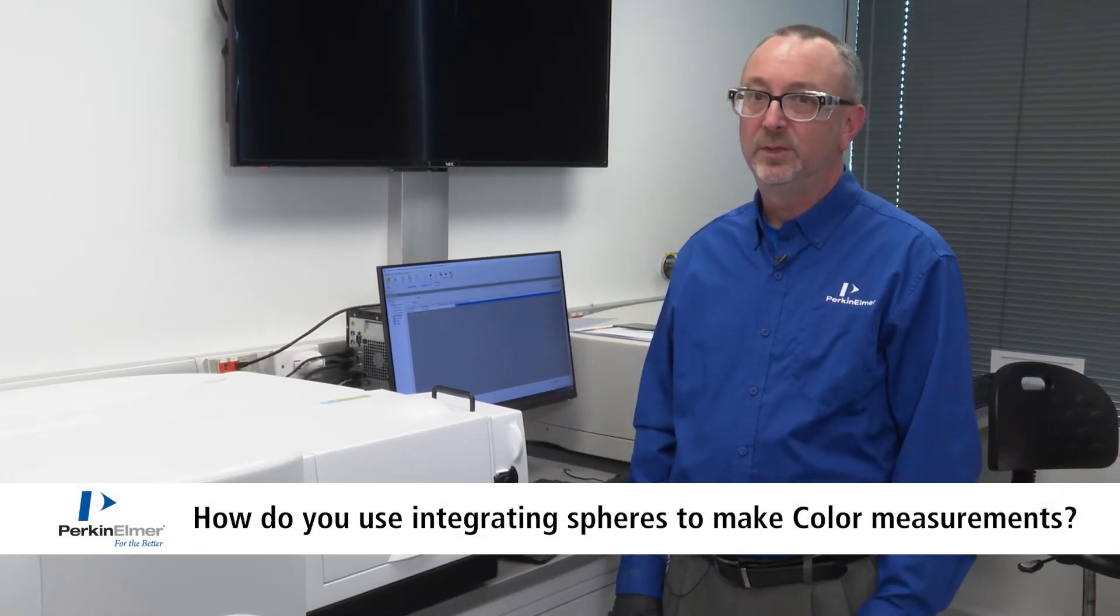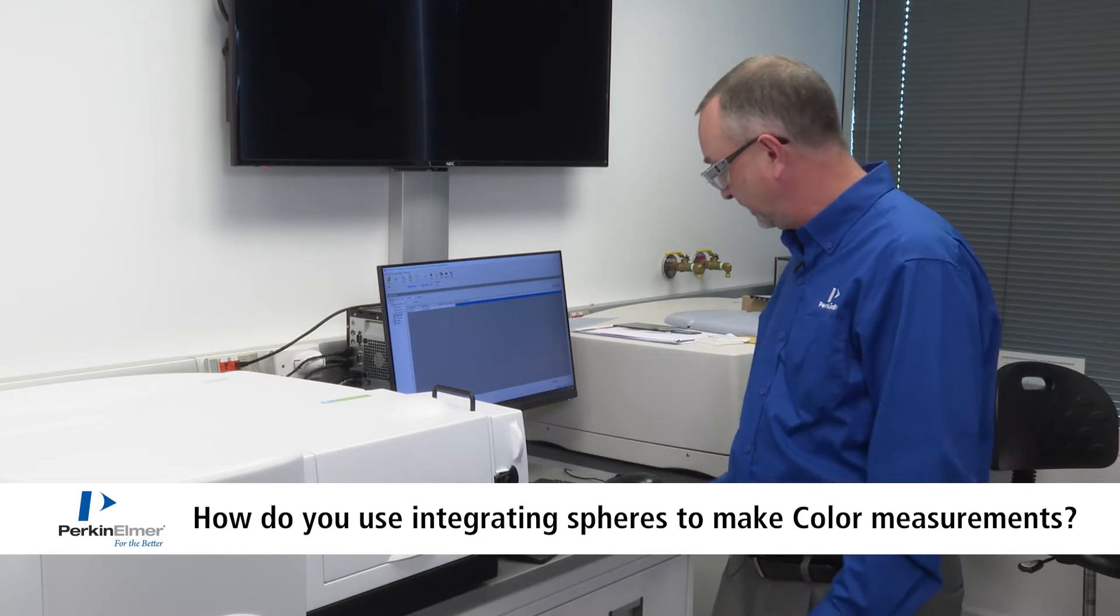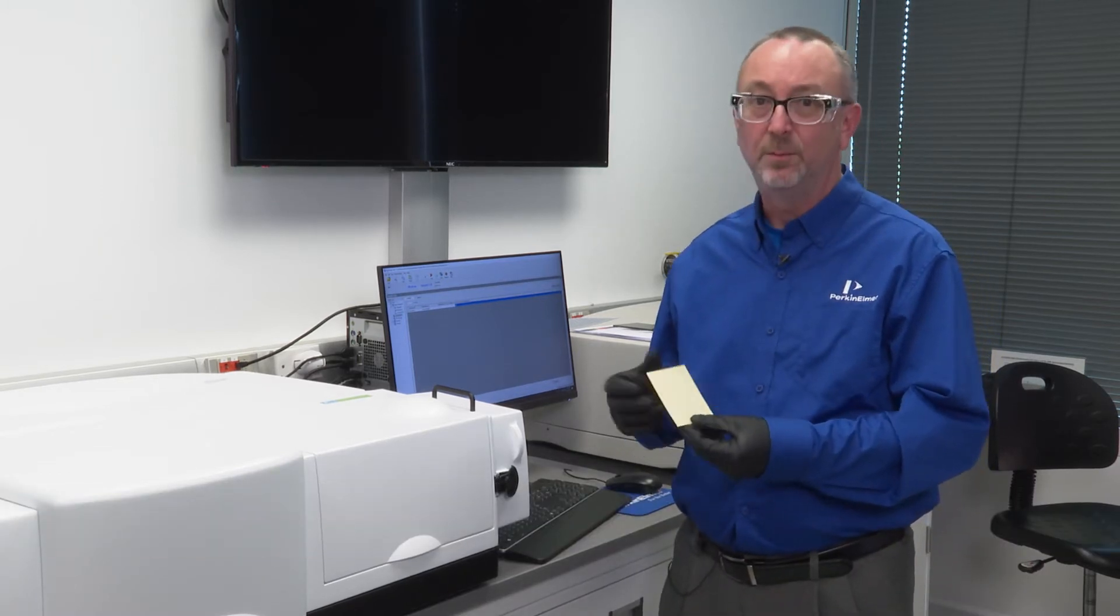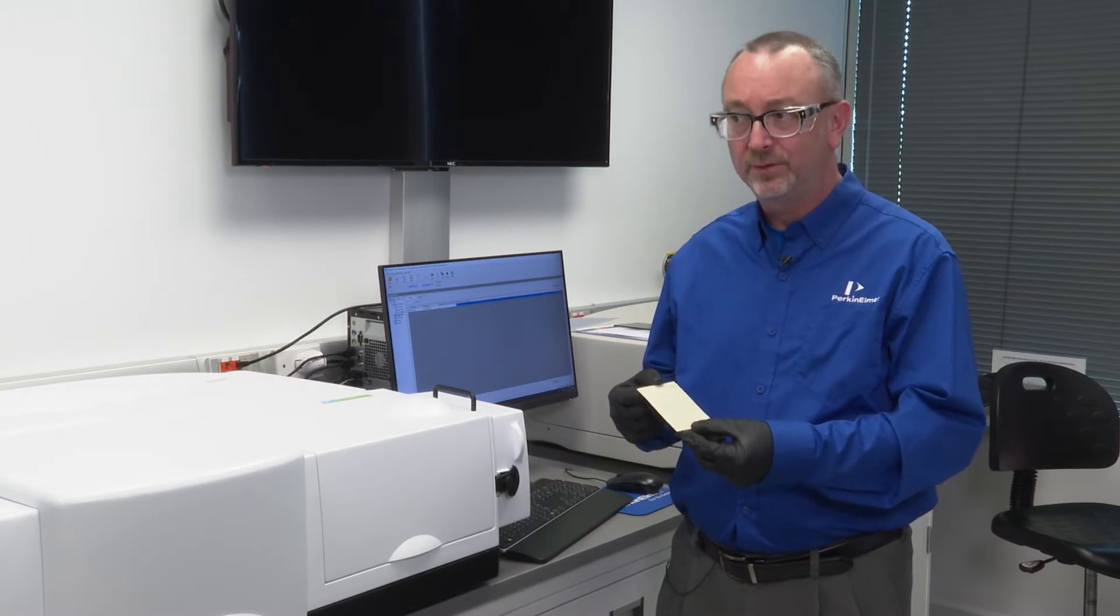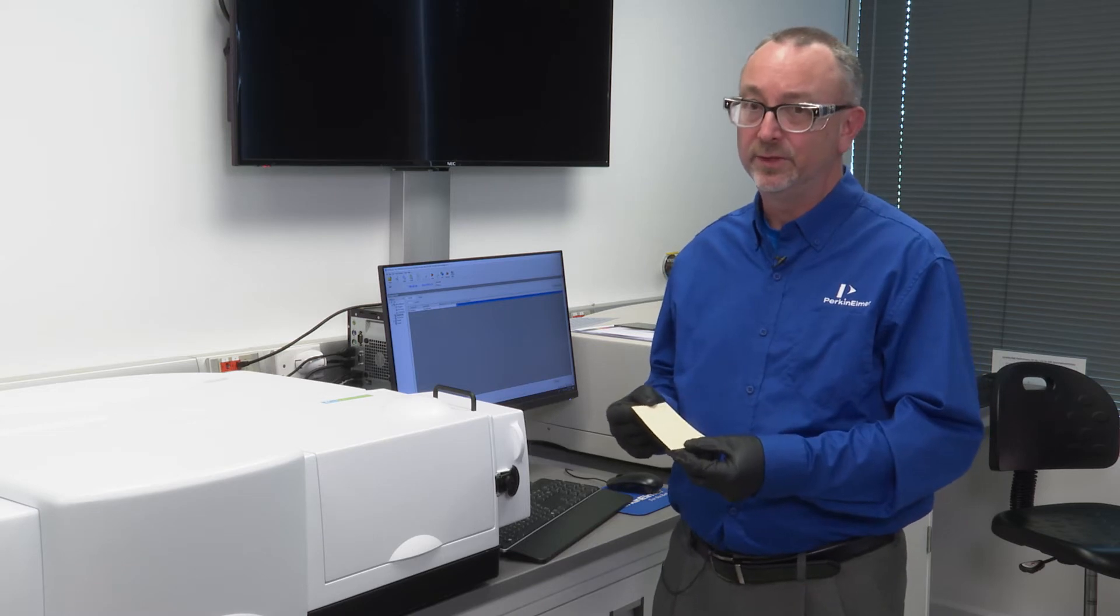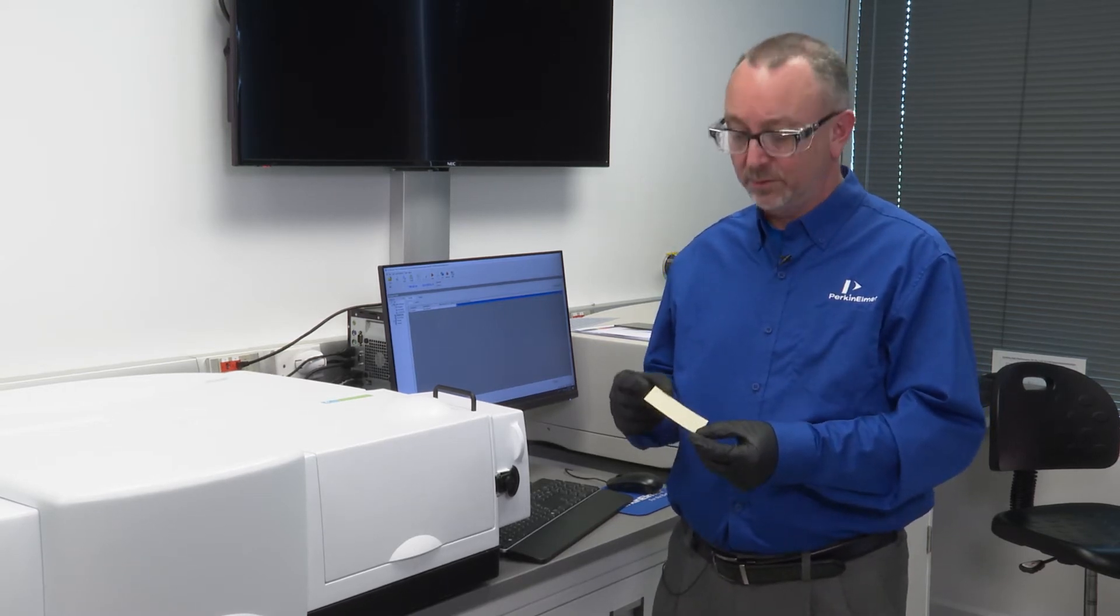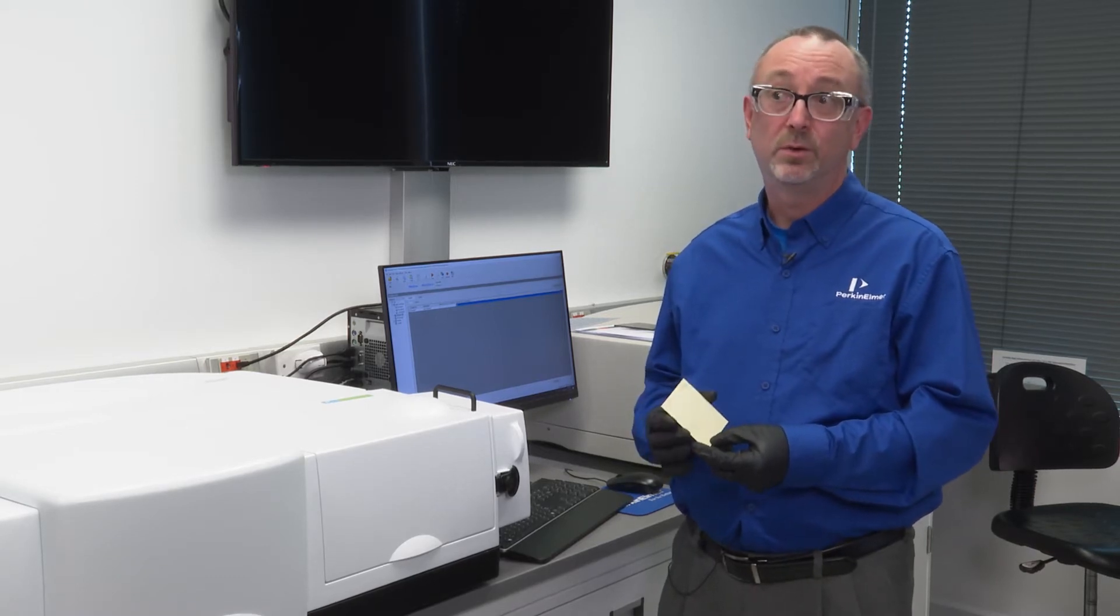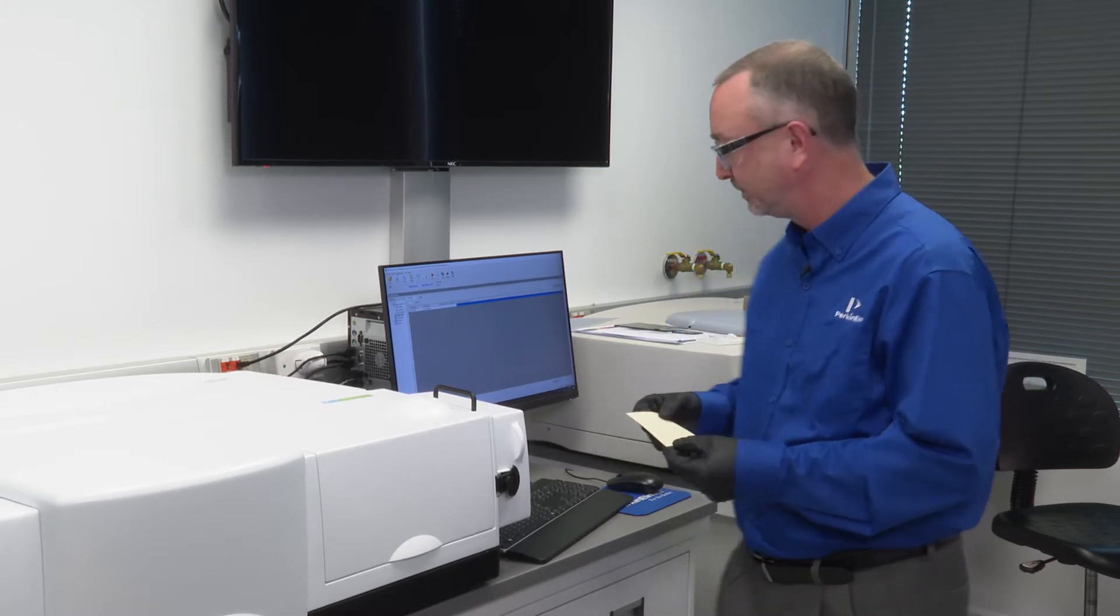Color analysis is typically performed with a 150mm integrating sphere. The reason for that is because many samples are paint-based and typically diffuse. Diffuse reflectance implies exploiting a 150mm integrating sphere. Smaller spheres can be used, but some of the protocols that are used throughout industry require large integrating spheres such as the 150mm sphere.